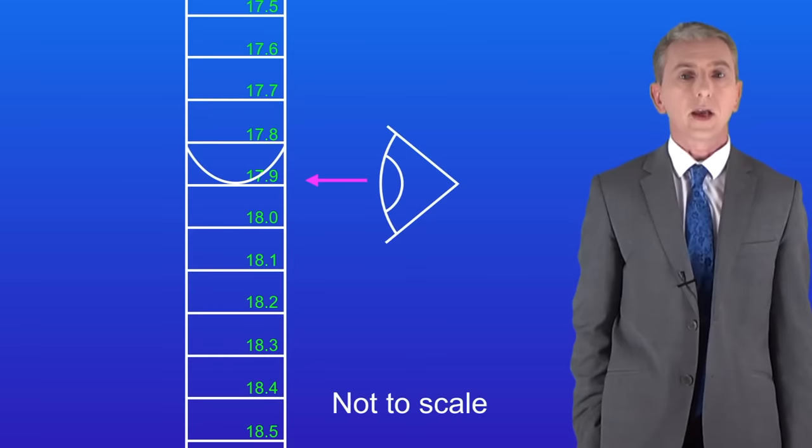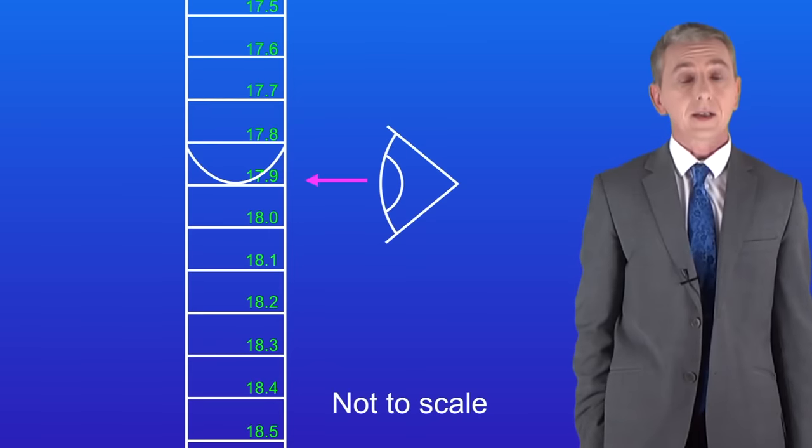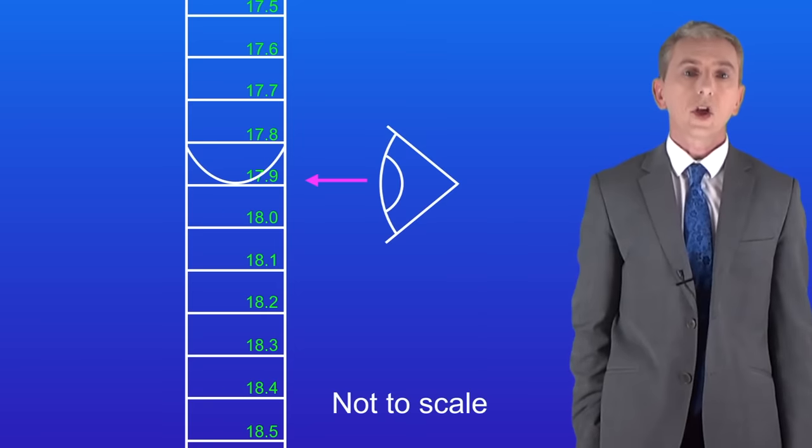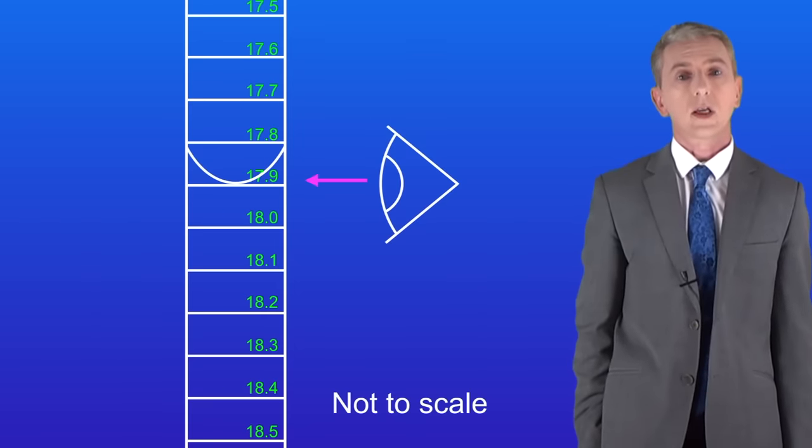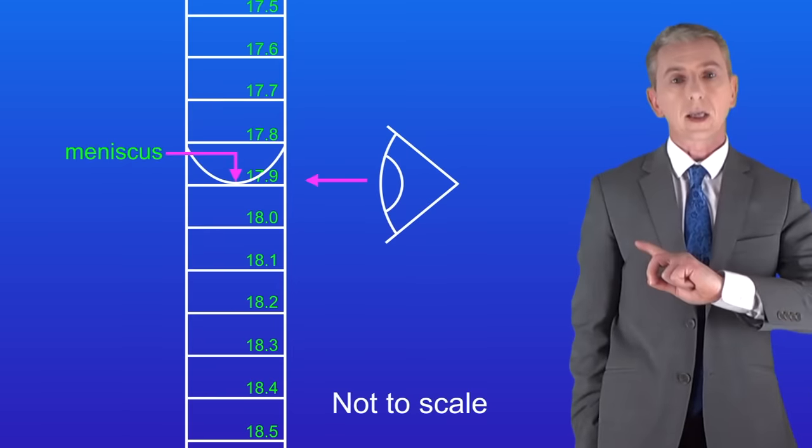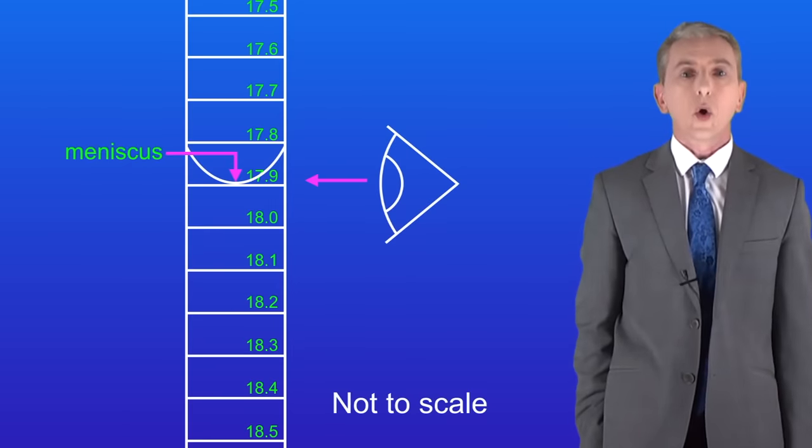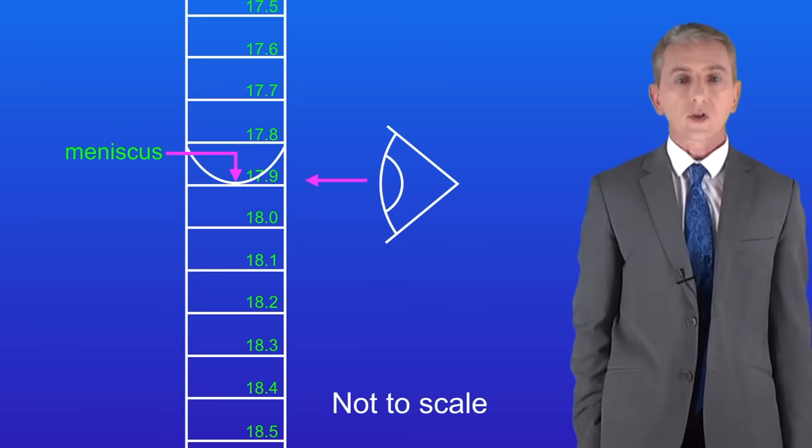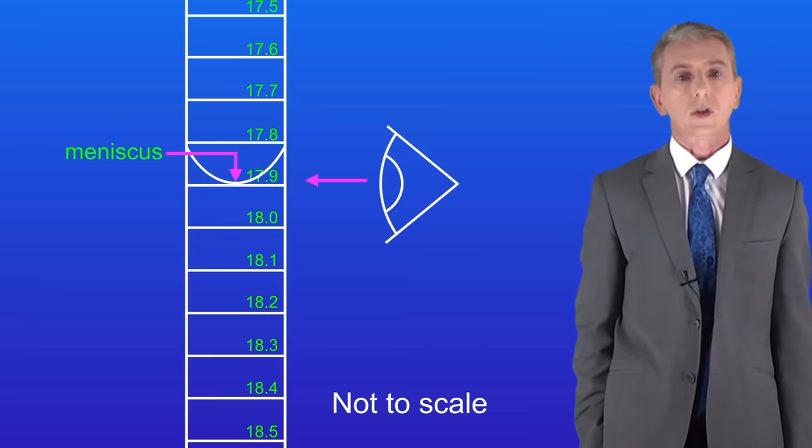When reading the burette you need to make sure that your eye is level with the surface of the liquid. The surface of the liquid naturally curves. Scientists call this the meniscus and I'm showing you that here. We always read the burette at the bottom of the meniscus so in this case the reading is 17.9 centimeters cubed.